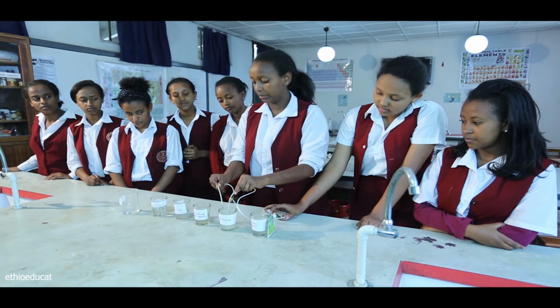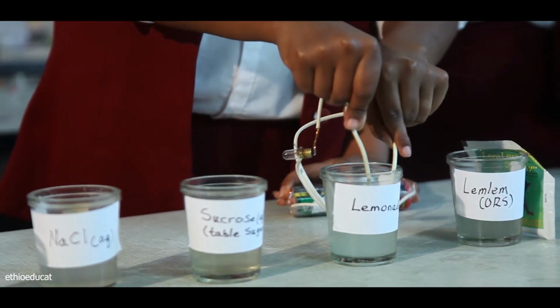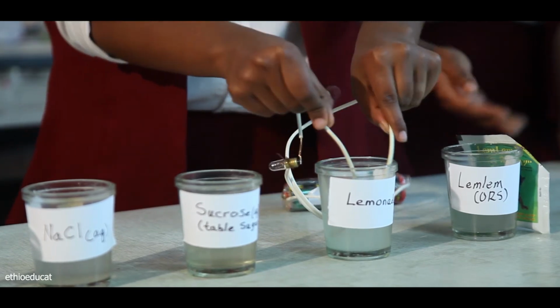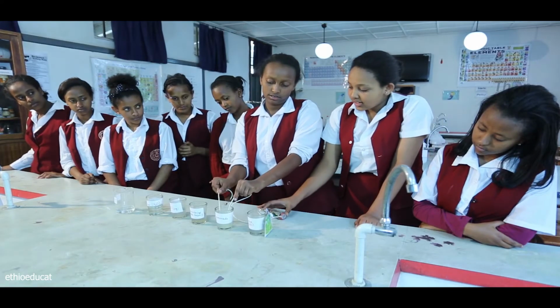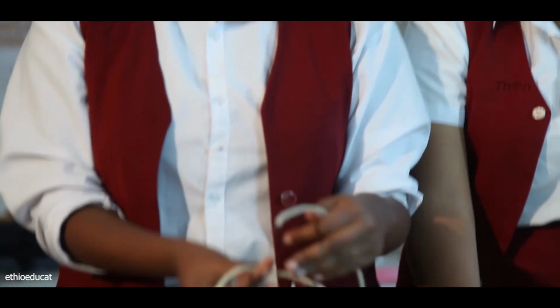Let's see what happens in the lemonade. Okay. Is the bulb lighting? No. Okay. So, Kebron, why do you think this is? I think it's because the lemonade is just citric acid, which is an organic compound, not an inorganic compound, and it's covalently bonded. Yes. So, as she said, we have squeezed the lemonade. So, it comes from a lemon, which is citric acid, which is an organic compound. That means it's a non-electrolyte, meaning it's covalently bonded.